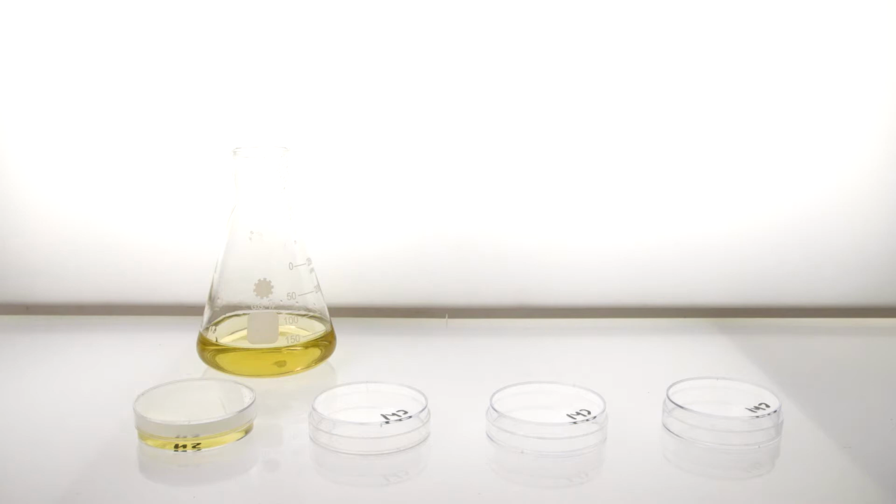Wait until this molten agar is hot but bearable to the touch. The agar will be around 50 degrees Celsius. Waiting for the molten LB agar to cool a bit is very important because many antibiotics are heat labile, meaning that they'll degrade at high temperatures. You need to add 50 microliters of chloramphenicol per 100 milliliters of molten agar.